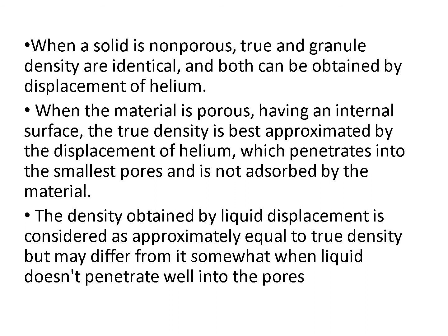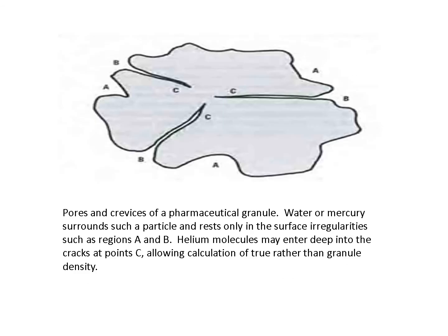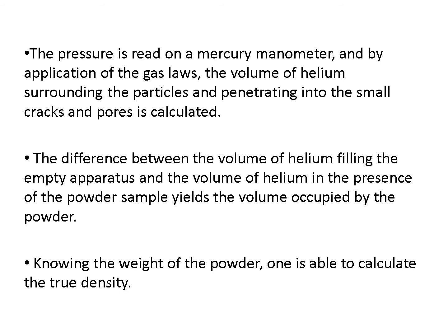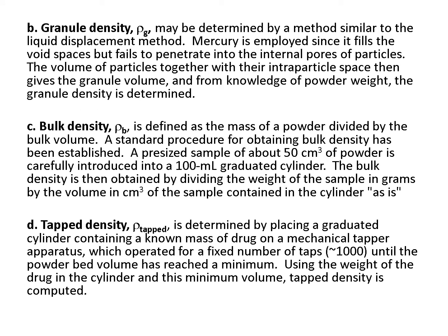This is also, I will add, you can watch that video on YouTube. Just try it on YouTube, determination of true density using helium pycnometer, and it is done in our university. Okay, watch that video. Practically, we can measure the true density by helium pycnometer, and we can get it from the references.